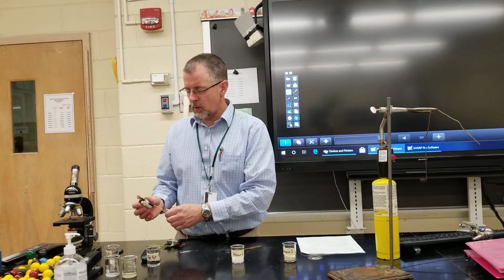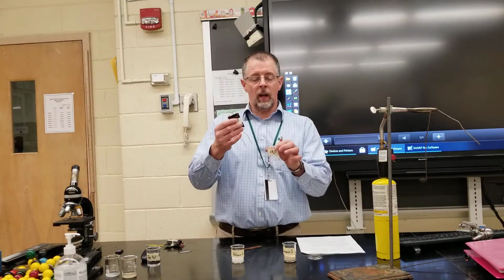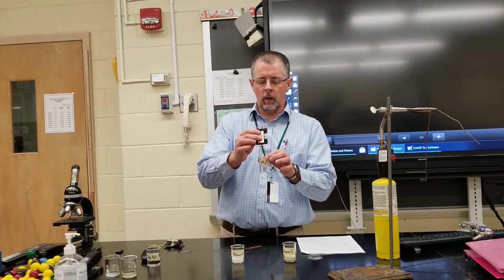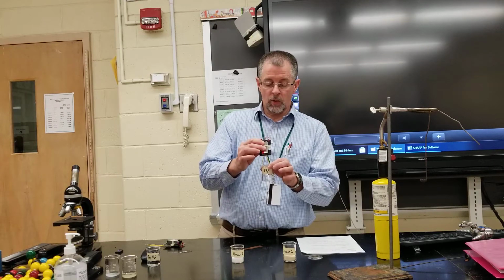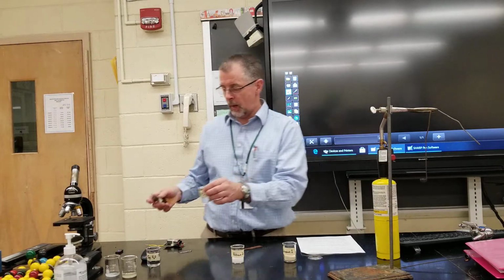Now, if we were to take some deionized water, which means we've taken the ions out of the water, and if we put the electrodes in here, we see it does not light up at all. So we see that there are no ions in this water at all. It's been deionized.